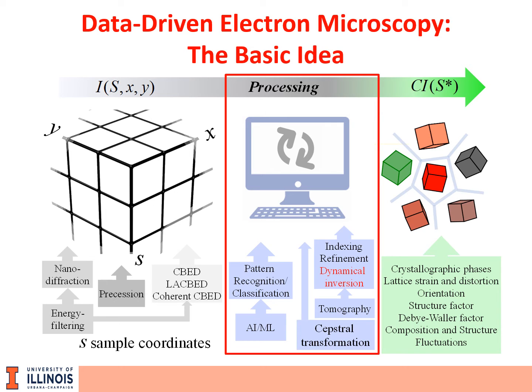We can also introduce the advances in data science, including artificial intelligence and machine learning. By processing, we extract crystallographic information and use that for imaging, and this significantly expands the capability of transmission electron microscopy.